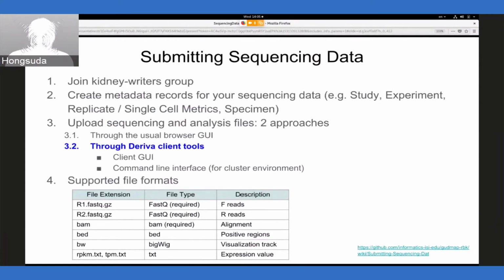Okay, so who's asking this question? Gervais from Doug's Lab. Okay, so we maybe can take this offline. Right now, I think it's strictly expecting R1.fastq.gz. Otherwise it wouldn't know what this file is about. So maybe we can discuss and then talk about what kind of thing we can do, or maybe we can give you some suggestions on how to do it on your end.